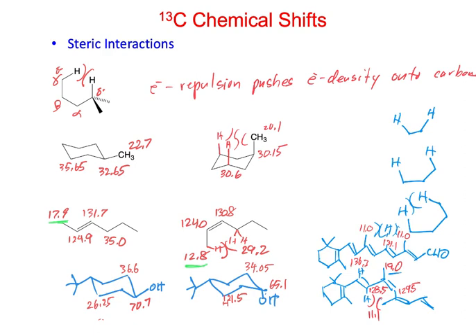So there are some examples, and I know I don't have them here, but if you have things like this, a methyl group on just a double bond on a chain like this, there's pretty good differences, and that keeps shifting between that and this. And you can essentially assign, based upon the chemical shifts of this methyl group, whether it's an E or Z double bond.